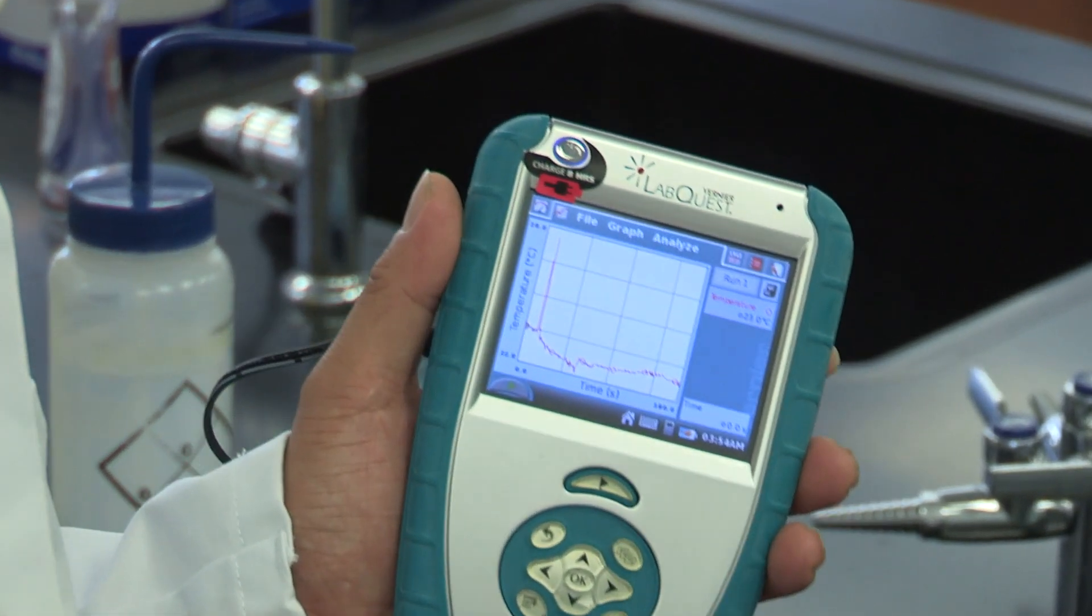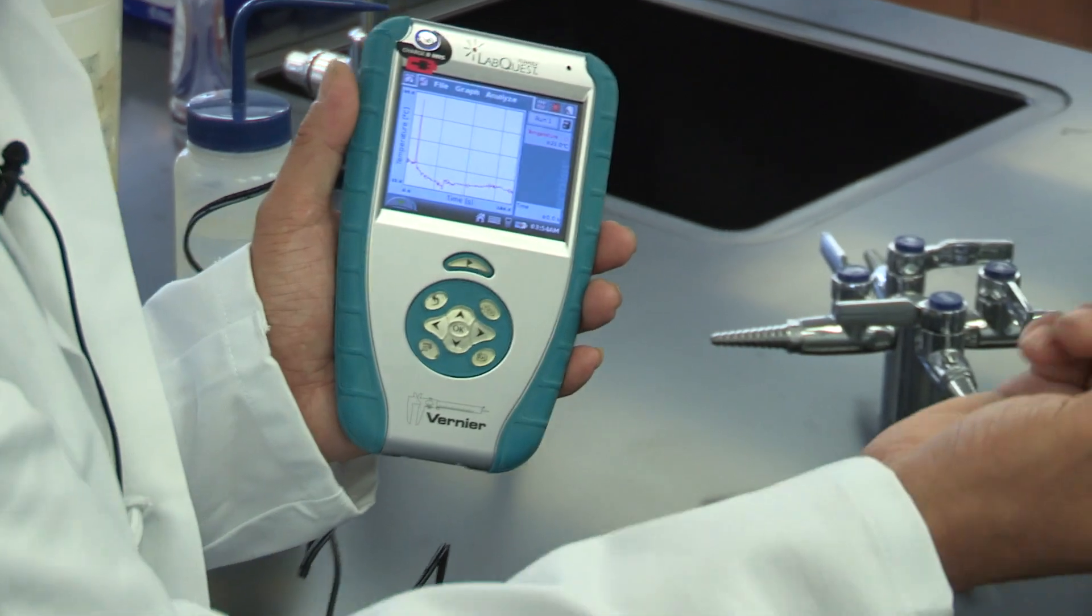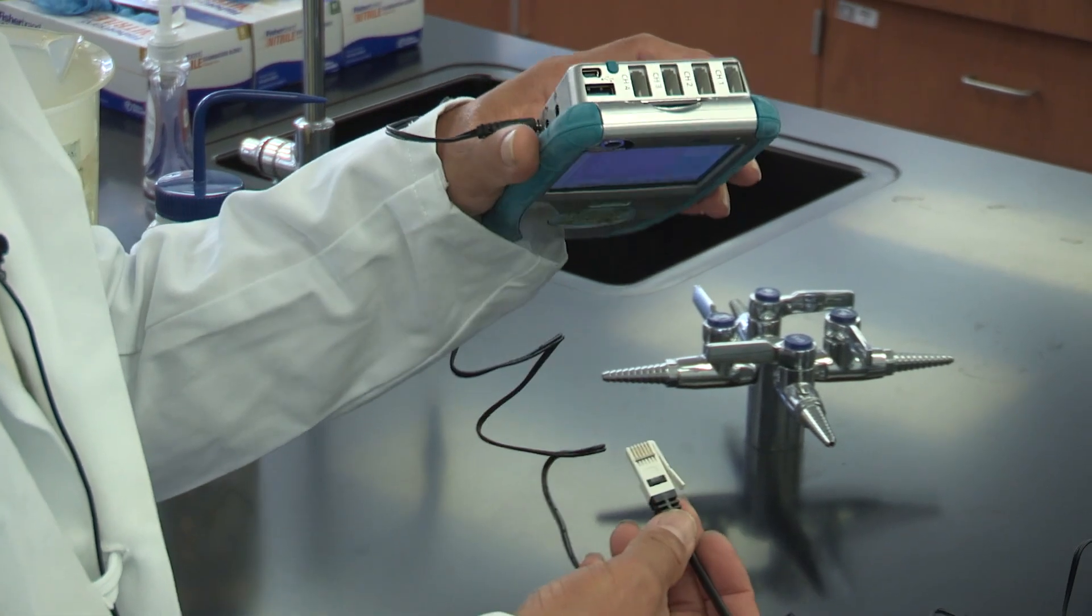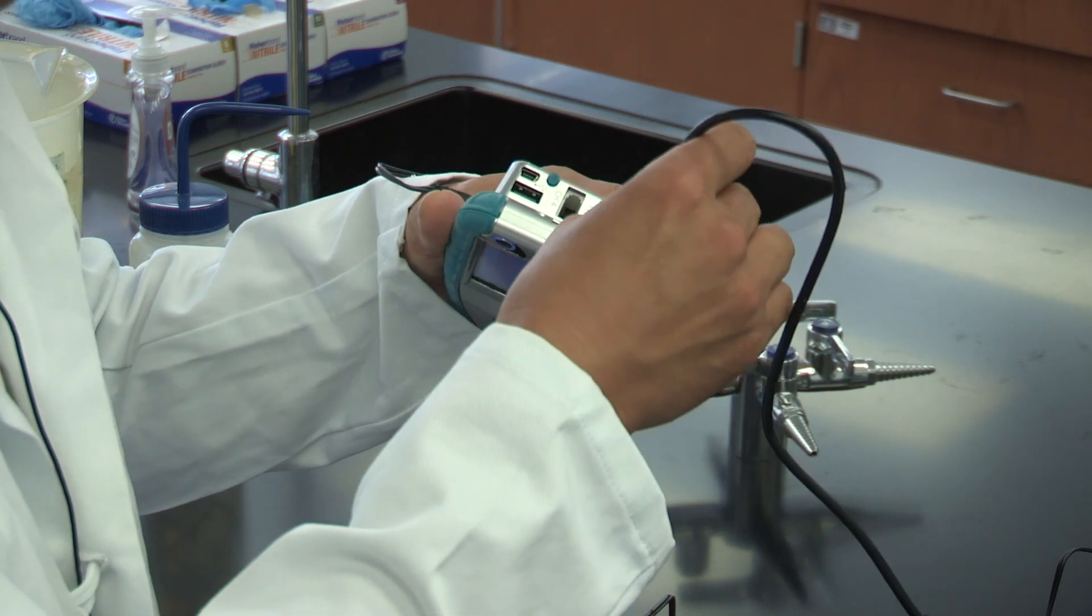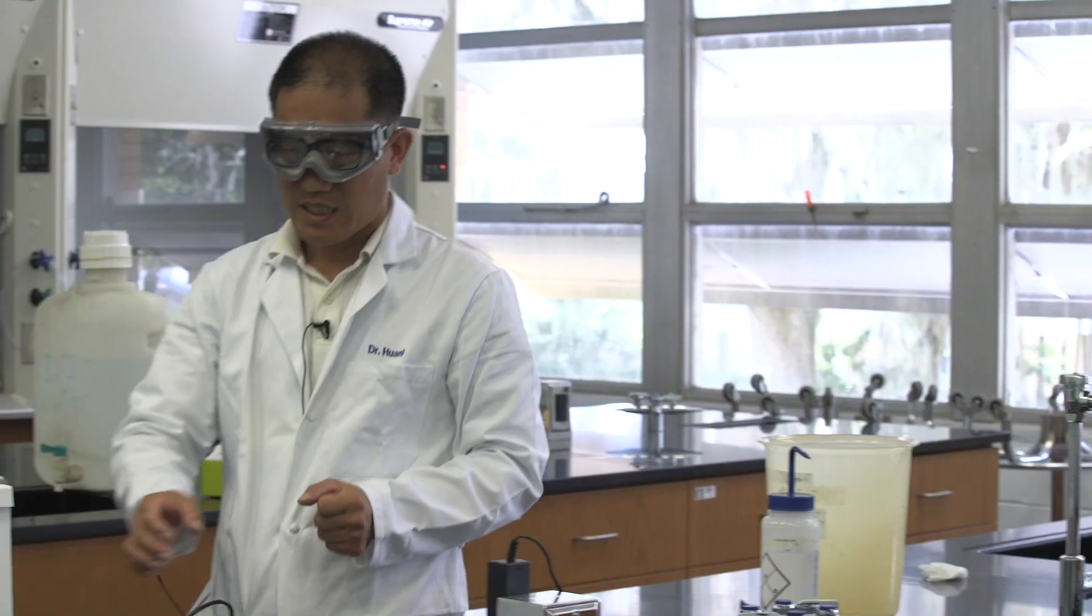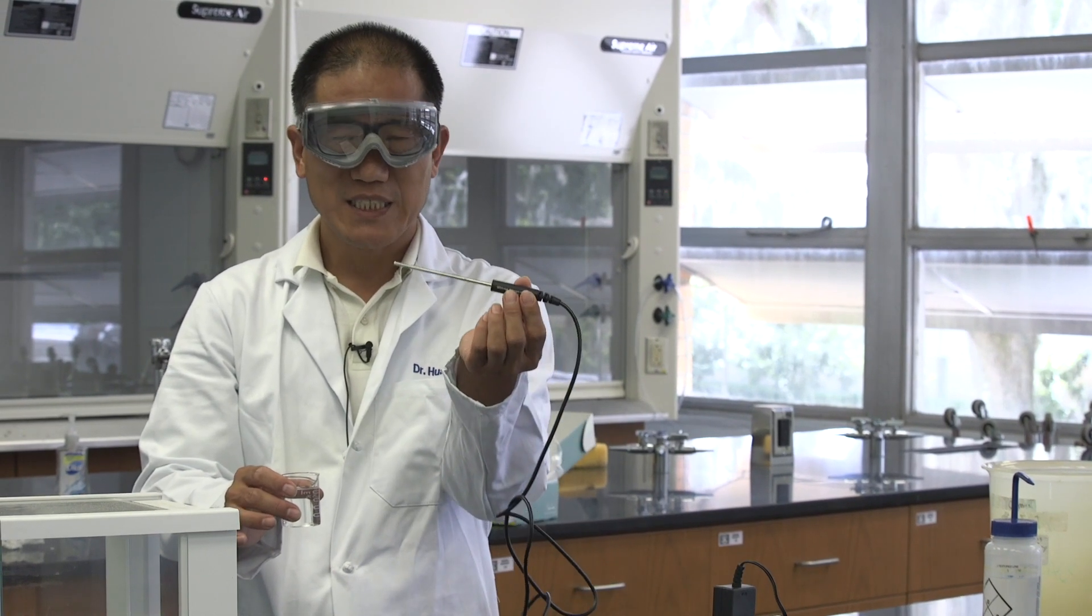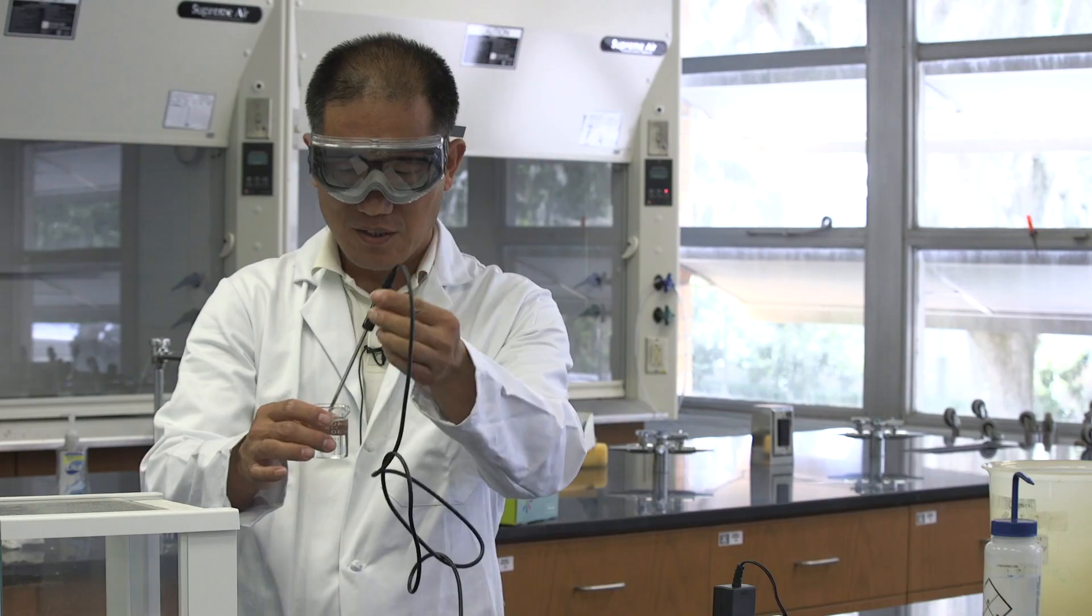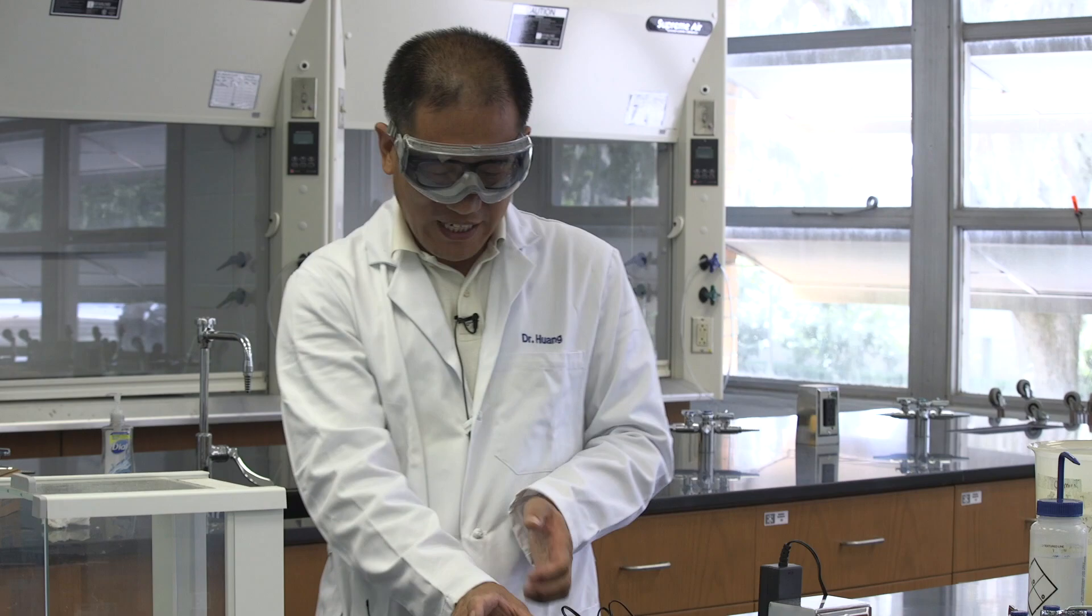This is a LabQuest product. We can attach different sensors to take different measurements. In this particular experiment, we are trying to determine the temperature of the liquid we are using. This is the temperature probe. Look at this end. And we can find an empty slot on the LabQuest device and then insert it in. We should hear a click. This is the liquid we are using. And this is the temperature probe. All we need to do is we insert the probe into the liquid. Let's look at the temperature of the liquid.